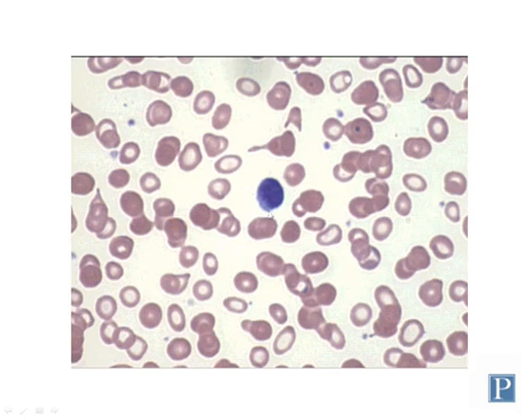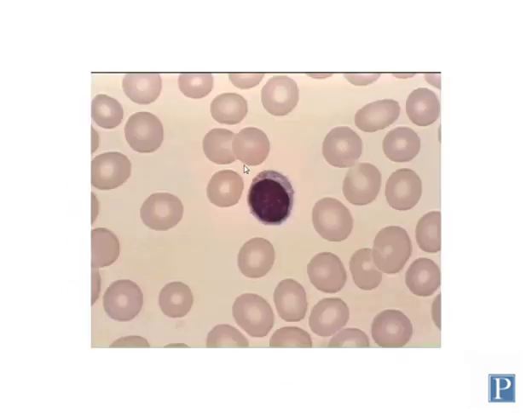This is a relatively small, perhaps medium-sized lymphocyte, and it's a little bit bigger than red blood cells. Some of them can be quite a bit larger, though, and so the size, again, is not the best method of distinguishing them. What you should look for is their characteristic large, regular circular or spherical shaped nucleus, which is very basophilic. And the nucleus is so large in these cells, it takes up most of the volume of the cell, such that you usually only have a thin little rim of cytoplasm outside of the nucleus. That's the hallmark characteristic of lymphocytes.